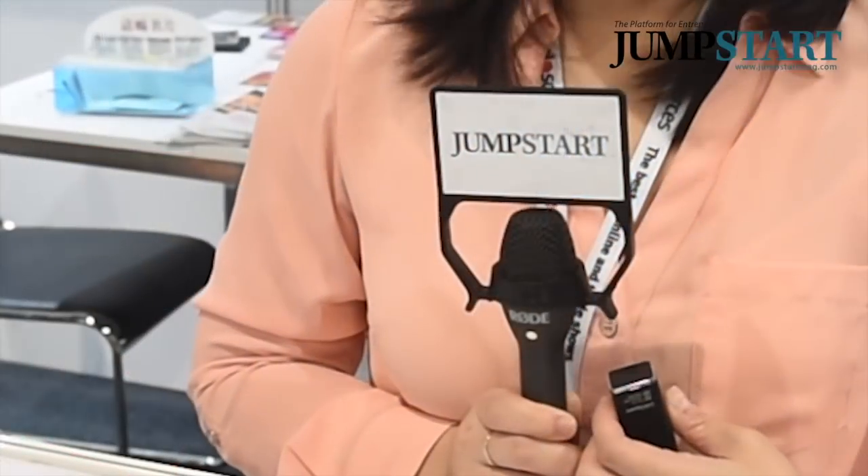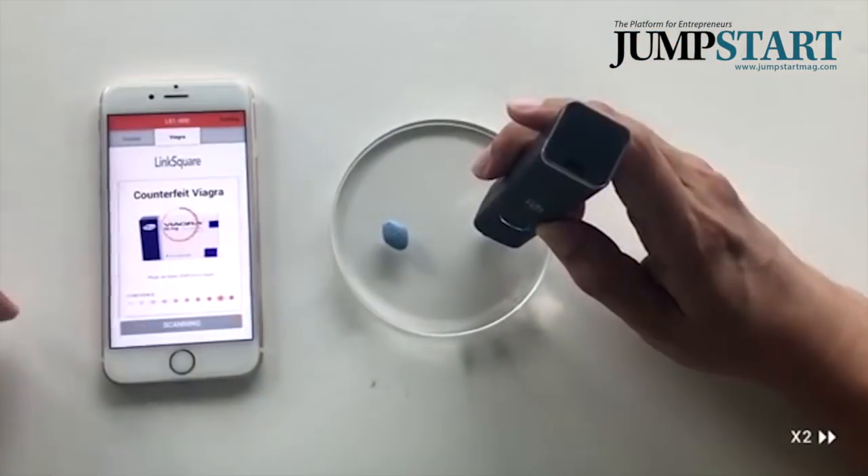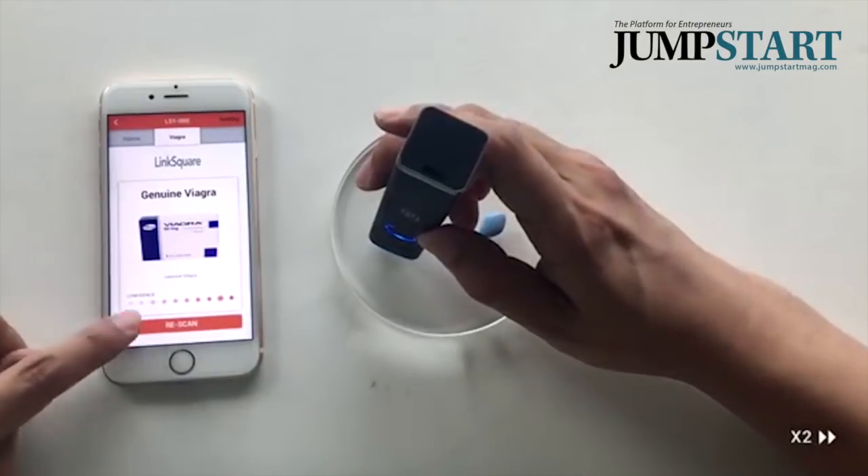By using our Link Square, you can add more applets that you want. For right now, we are working on the freshness of meat, detecting counterfeit medicines, and detecting special inks.